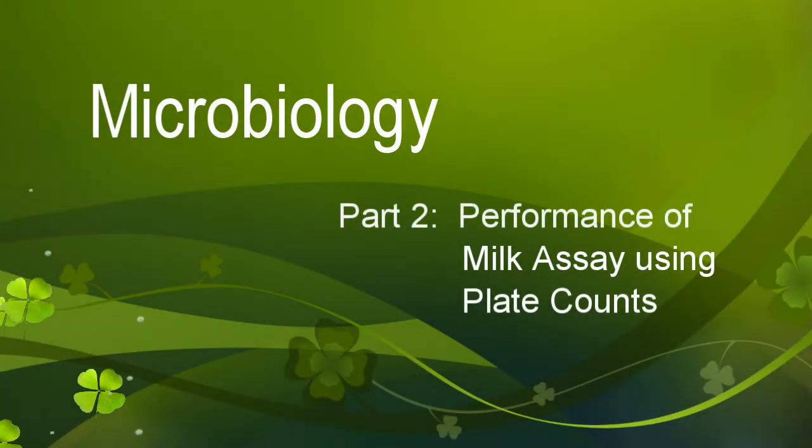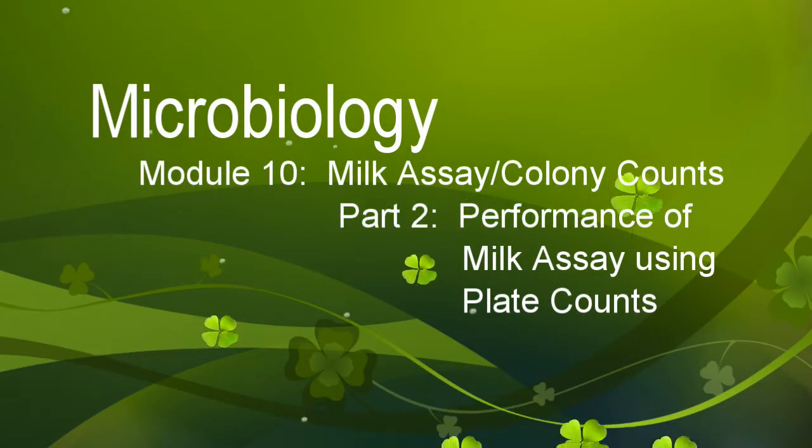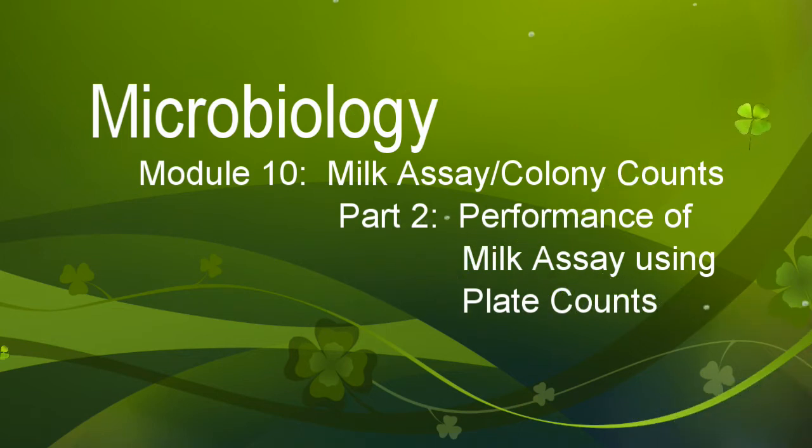Welcome to the video for Module 10, Part 2, Performance of Milk Assay using Plate Counts.